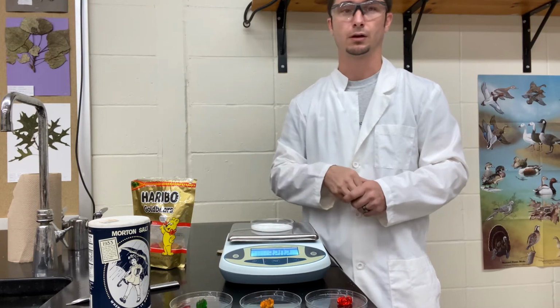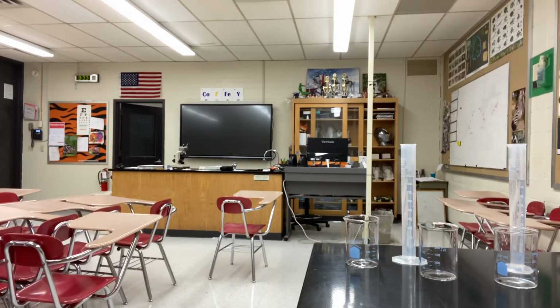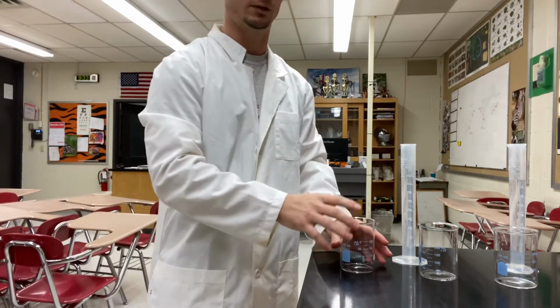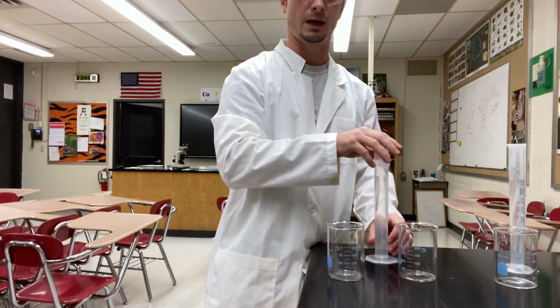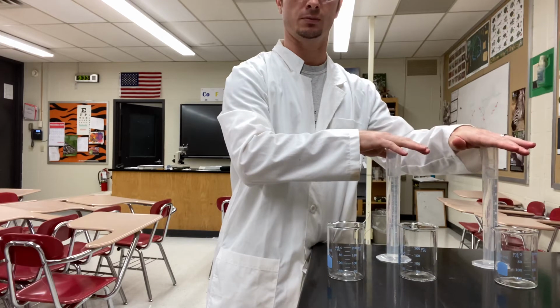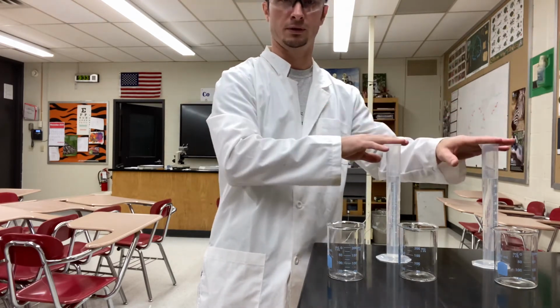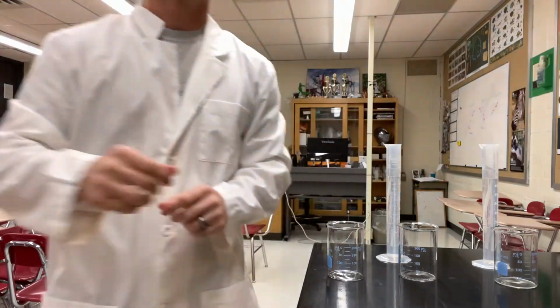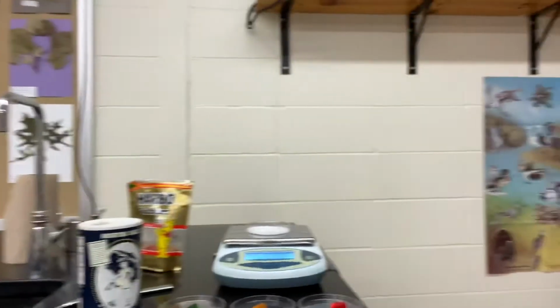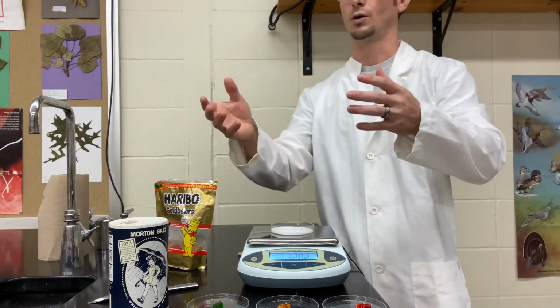We've also got our digital scale. We're also going to use 3 beakers, once again, to test all this. So we've got 1, 2, 3, and we've got 90 milliliters of water in these 2 graduated cylinders, which is also going to become important because osmosis is the net movement of water, so we're going to be using that, okay?